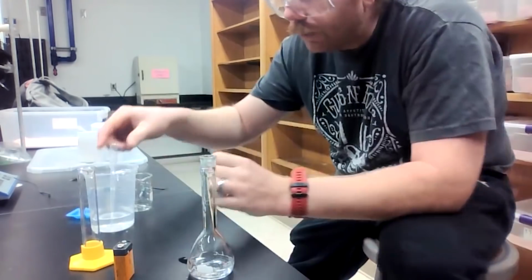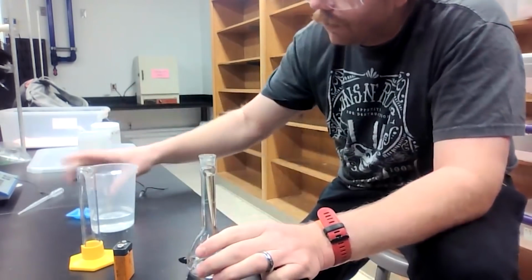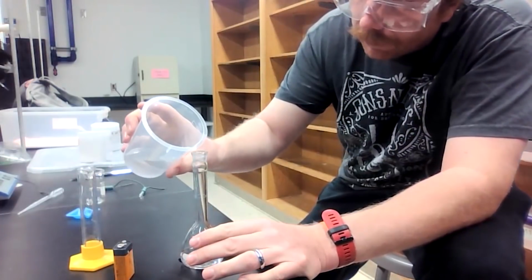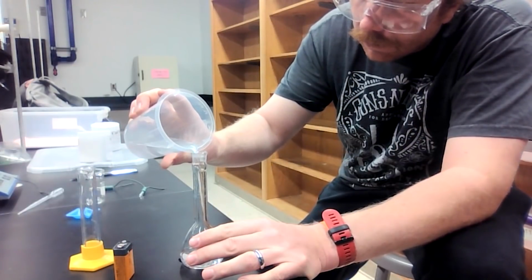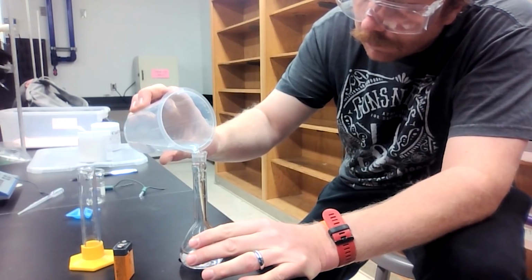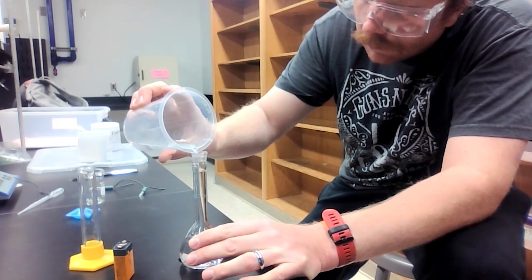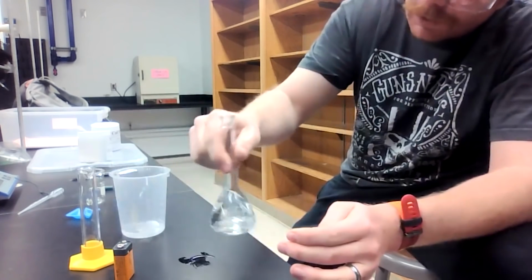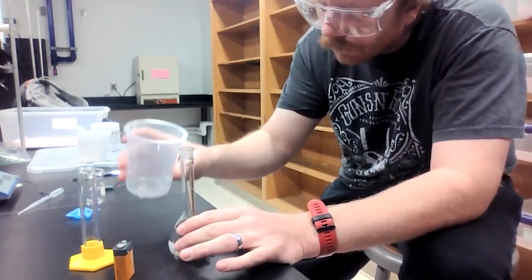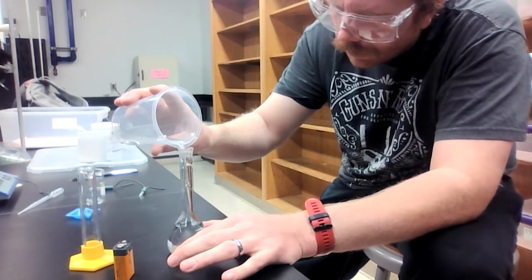And one way that I can do that is by filling this up 3 times. Or I could go and just use my volumetric flask again. I'm going to swirl this. And then I'm going to get all the way up to that line.